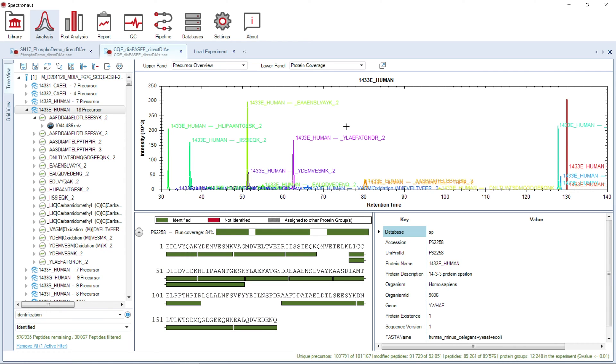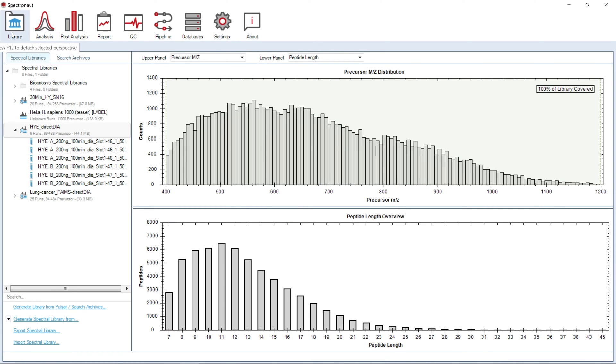Let's have a quick overview of the available perspectives. In the Library Perspective, you can generate and review Spectral Libraries.